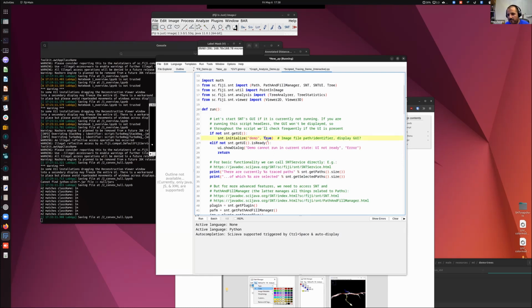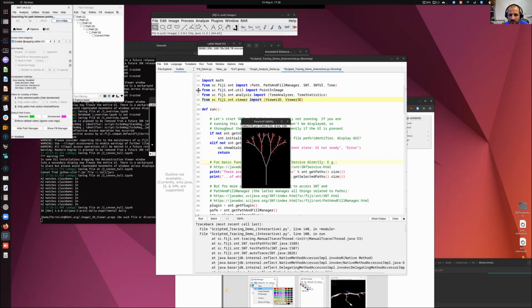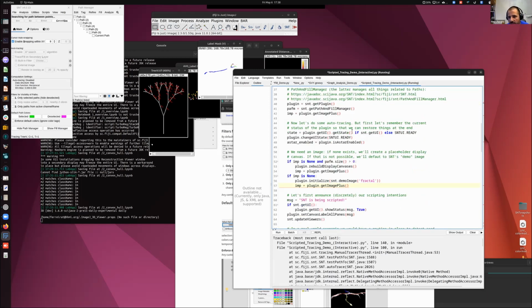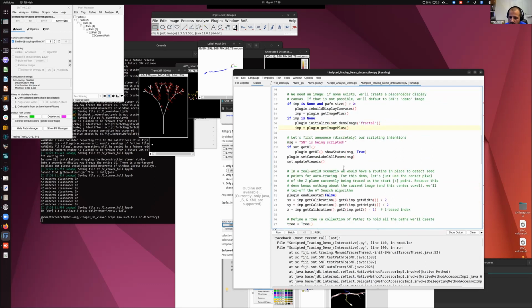And this is a Boolean flag that tells whether the GUI should be displayed or whether we want to work headless. The advantage of working headless is that you could run it from a cluster or from something else. Because the idea is that this is supposed to be an interactive session, we are being careful in case the GUI did exist, to make sure that it's ready. If it's not, it pops up a message saying, please stop what you're doing because I want to run something like that. And then you can access different things of the plugin that is running.